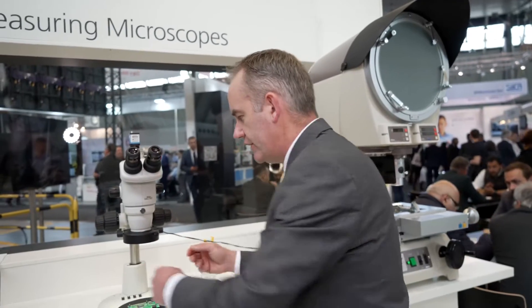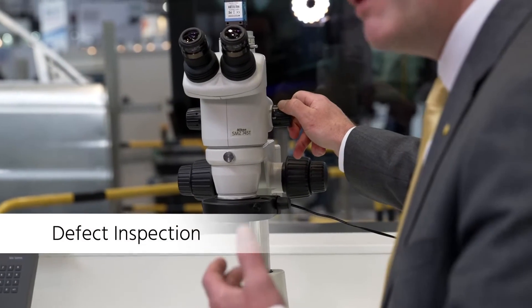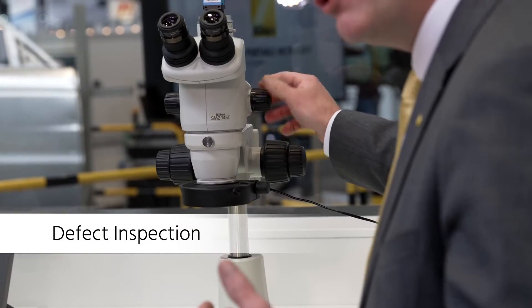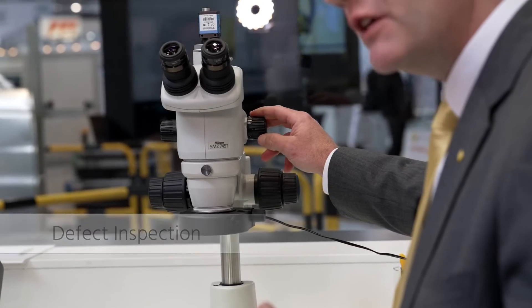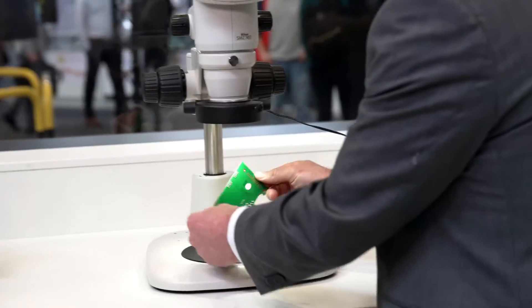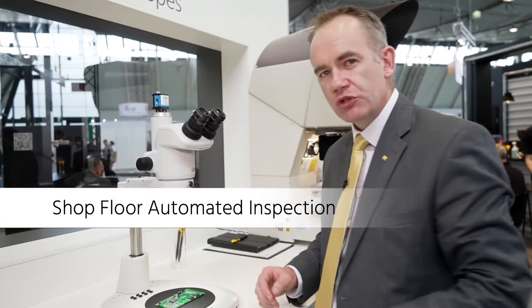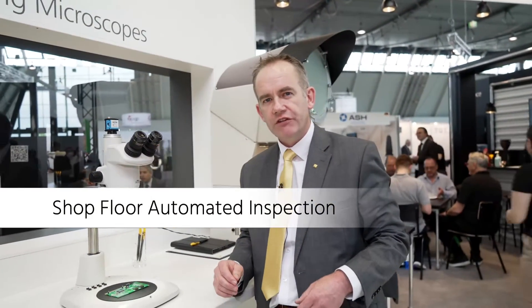The SMZ745 has a very nice working distance, LED illumination that runs completely cool, and you can zoom quite nicely — from maximum zoom back to lowest zoom while staying in focus all the time. You don't constantly have to change your hands, so you can pretty much operate underneath the microscope very easily and rotate your parts. For assembly work or inspection work, the SMZ745 is a very nice tool.